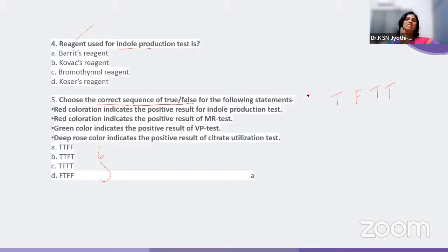If the bacteria have an ability to convert any compound in that medium and give rise to a product or produce a gas or produce a pH change, then it will be visualized either as a color change or production of bubbles or growth. You will be able to visualize it. Then you will consider whether that particular bacteria is positive or negative in the test.